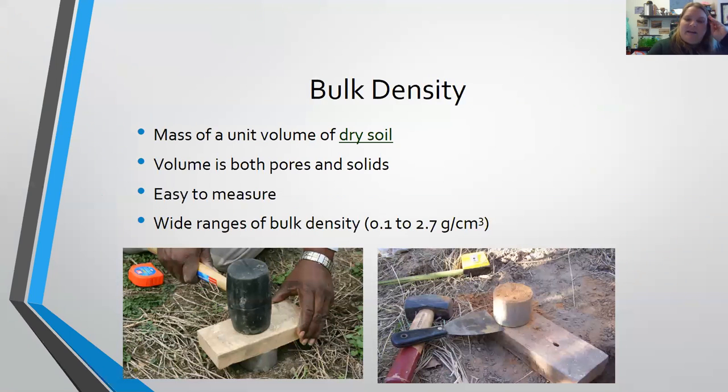And I just say that because I used to have to measure bulk density all the time, but of greenhouse substrates. And it's really hard to try to press a core into like peat, and when you pull it out, have it be really representative of what's actually happening, because peat is very, very easily compacted, or it smushes down, or you have these really long particles that make it really hard to push a core through it.